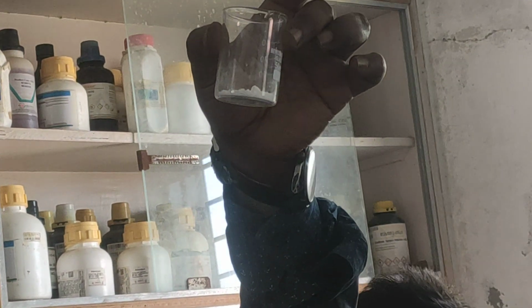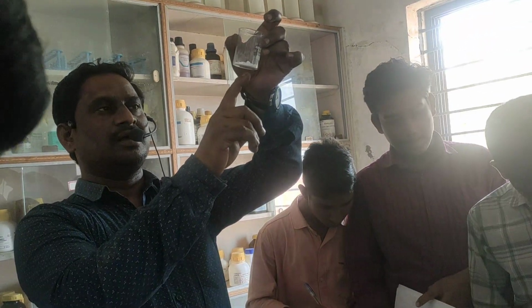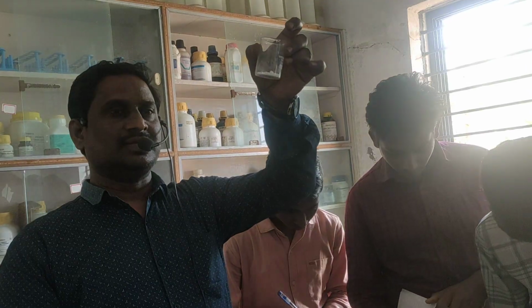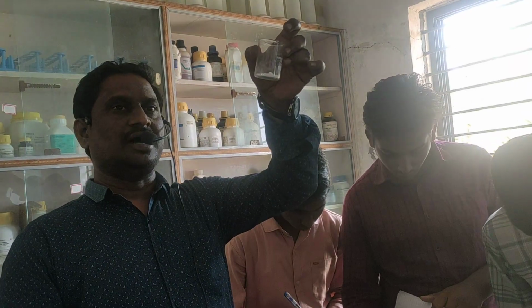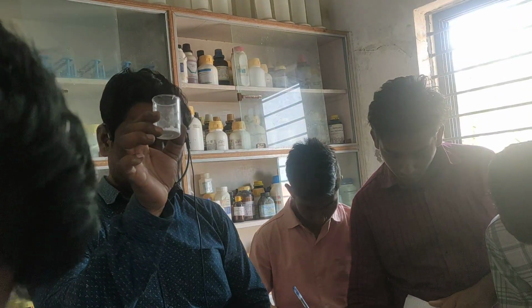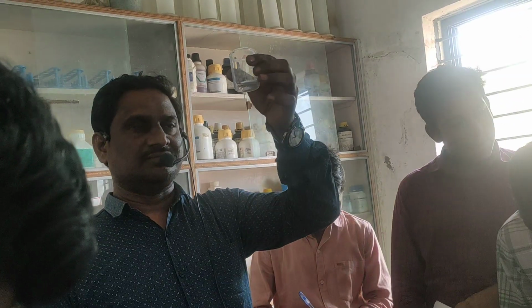Don't say white. What should we call it? Colorless. Write the second point: Color, colorless. Colored radicals are absent. Next, the third one is solubility test.